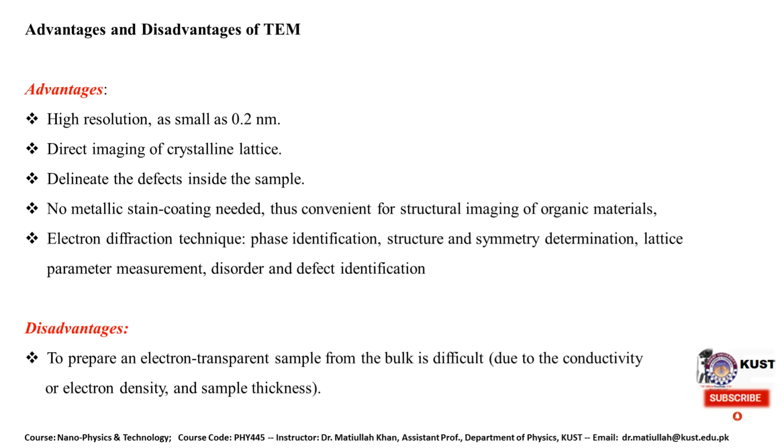The merits of TEM are that it has very high resolution compared to SEM, around 0.2 nanometer. The other merit is that it can directly image the crystalline lattice, and we get information about defects in the samples.